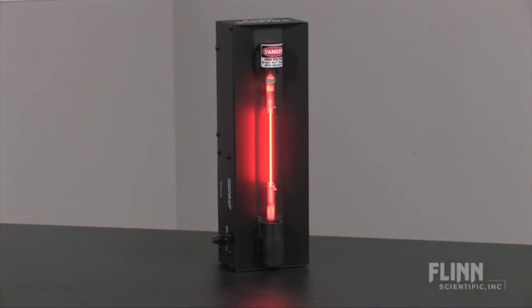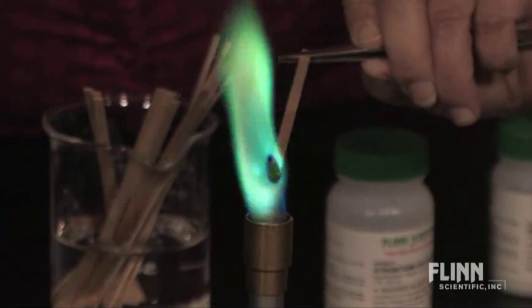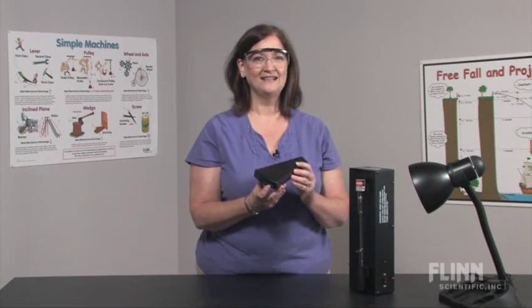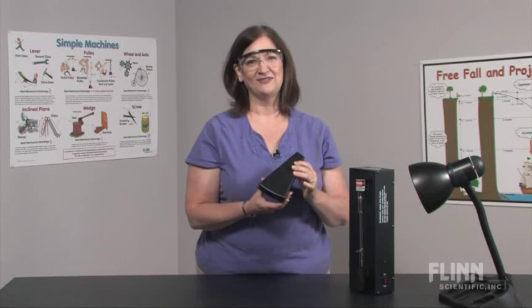The spectroscope is great for use with spectrum tubes and flame tests, and students will have fun examining various light sources around the school. Students will gain a better understanding of these important concepts as they see the light with the spectroscope.